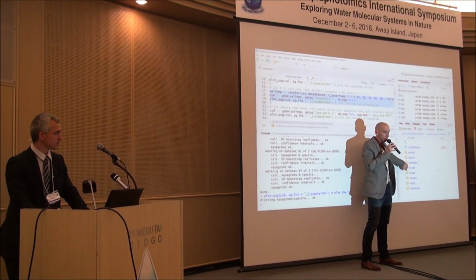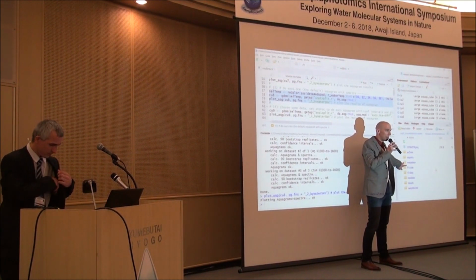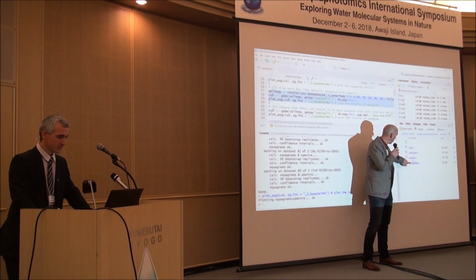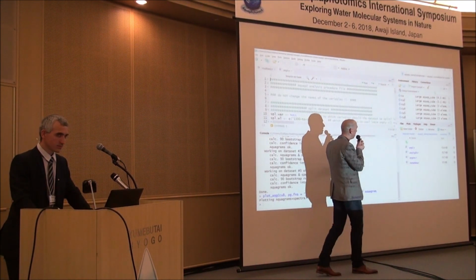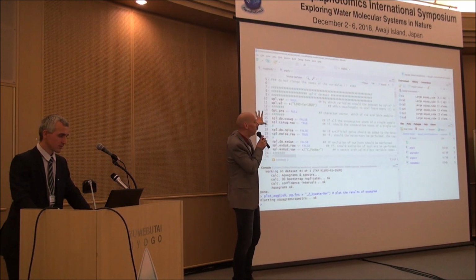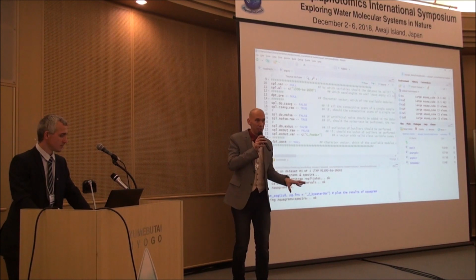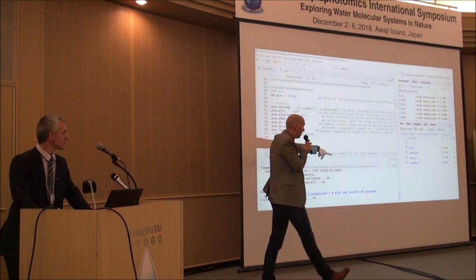We have the metadata folder. In this, there are two files. In one file, you describe the metadata of the experiment, you will see. In the other one you have the analysis procedure, if you open that, for example. So we provide a script that tells you exactly what to do in your analysis. This is extremely powerful, and that's what makes it a bit complicated. So you can describe your experiment, you can script your analysis in this analysis procedure here.